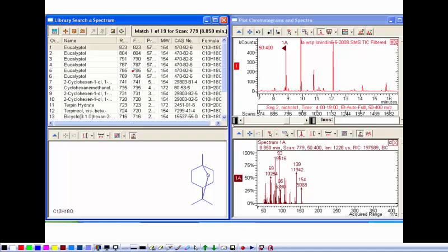What we found was that it was basically sap that came out from the wood, and also the varnish they had used to seal the cross, so there wasn't anything immaculate going on. But he wouldn't tell me that ahead of time. We didn't really need the secrecy, but you could pick that apart by looking at the different components and saying, oh yeah, they're all consistent with an older varnish that had been made.